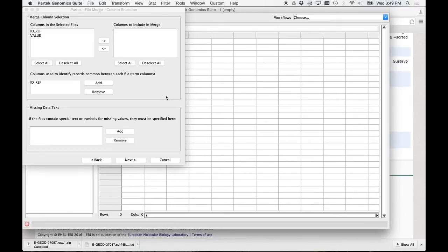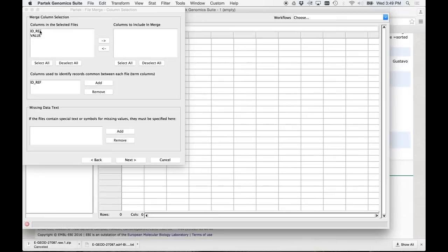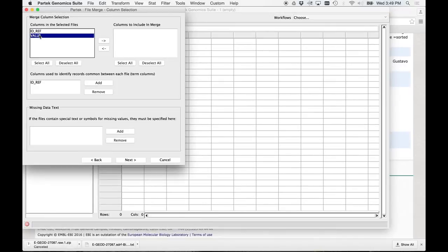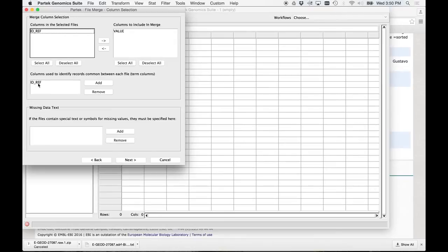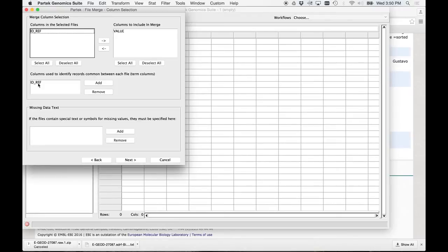Okay, this next one is basically telling you what are you going to use to connect all these files. So there's an ID ref. So that's the probe set number. That's what we're going to use to connect it. The only thing that's going to be different between these files is the value we give each gene. So here's what I'm doing is I'm selecting value, and I'm going to say columns to include in the merge. Value. And then here are columns used to identify records between them. It's the ID reference. So what it's going to do, it's going to take all of the values for a particular gene for each value and put it in a column. And it's going to connect all that into one big file. Okay?